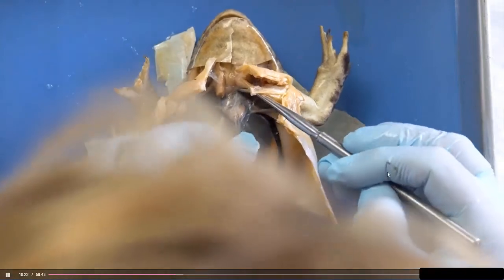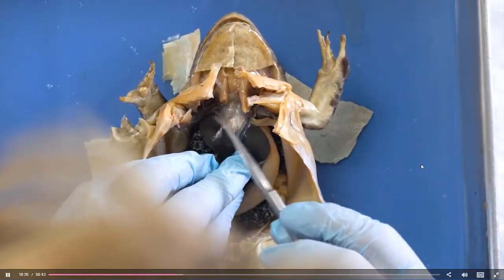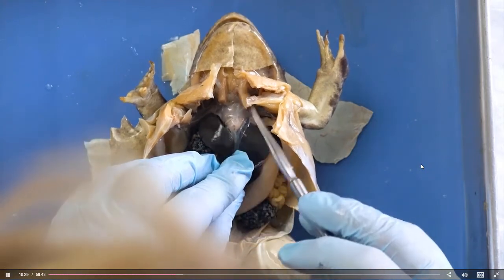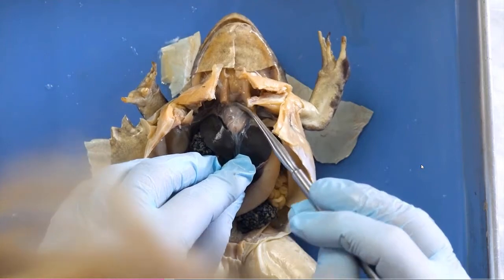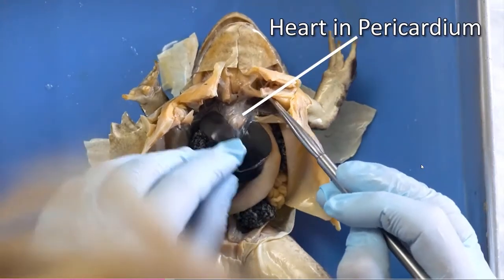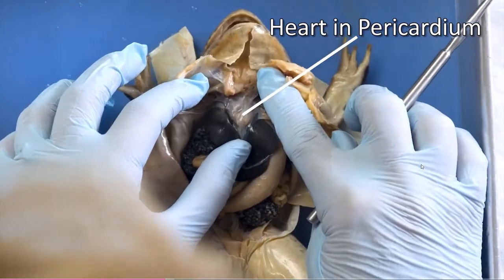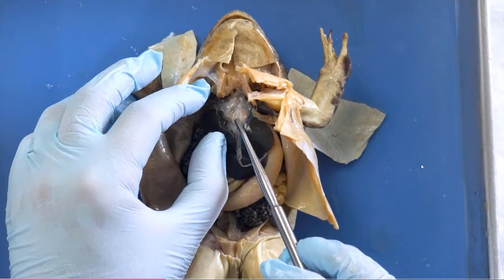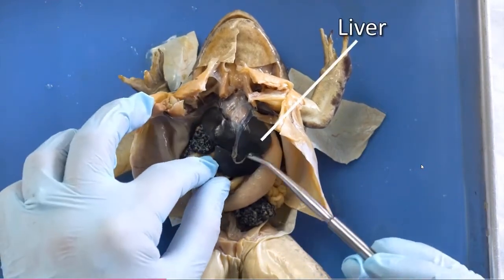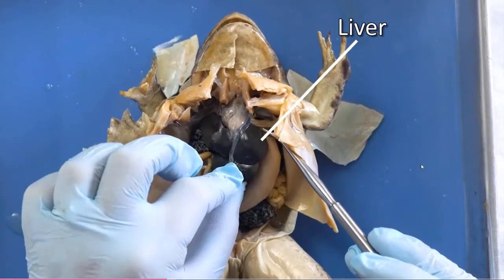Look up here where I've cut through the chest plate. I noticed something that appears to be in a bit of a plastic bag, so to speak. This is the pericardial sac, and this is the 3-chambered heart of the frog. We see the 2 atria at the top. I'm going to pull that back. And we see the ventricle at the bottom. This large structure that we see in the center of the frog is the liver.